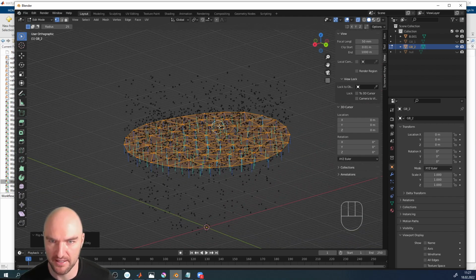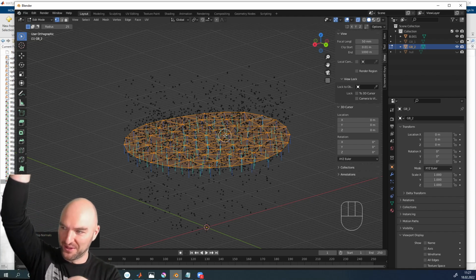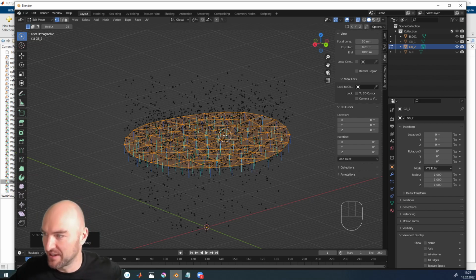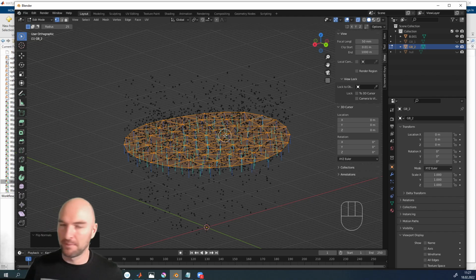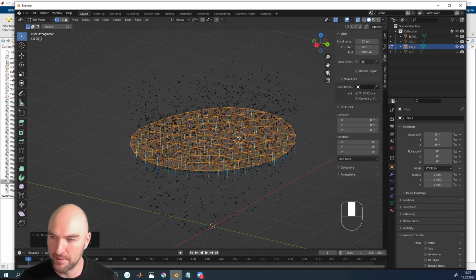Okay, so this is something you need to keep in mind, because if you have inconsistent normals, then sometimes you're analyzing in one direction and then you're analyzing in the other direction somewhere else, and that is something you always need to keep in mind. So if you have isosurfaces, then the isosurface algorithm makes sure that all of the normals point in the same direction.